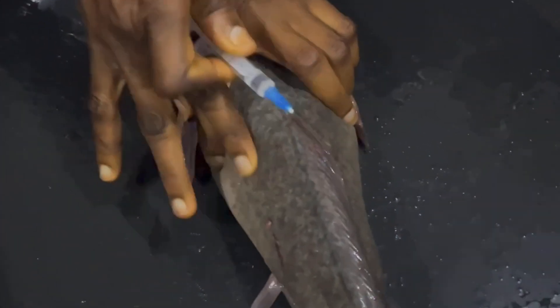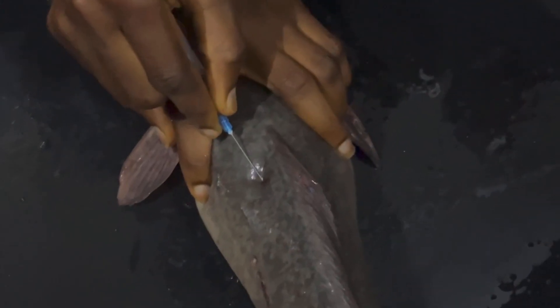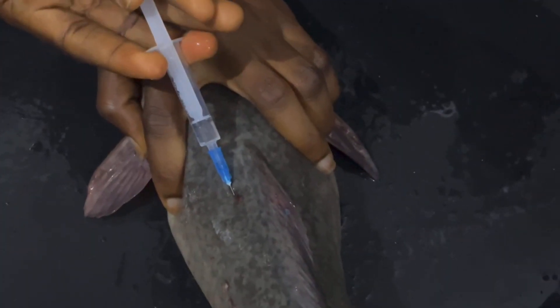Welcome. We are doing artificial reproduction for catfish. For those of you that may not have seen this part first, this is how we started.